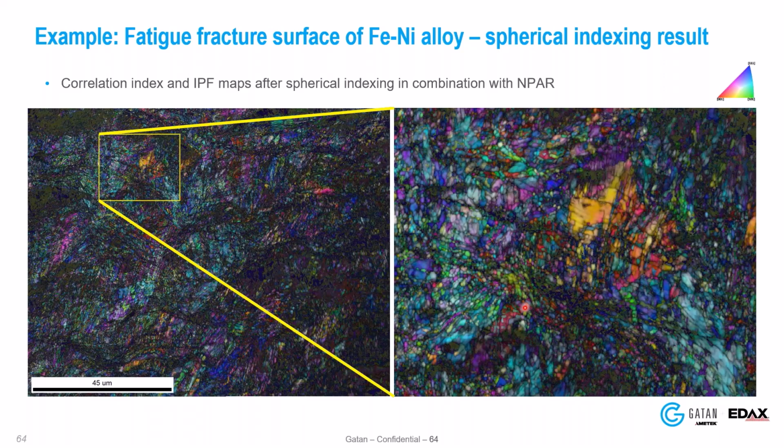On a fracture surface, this is a new type of analysis that's really enabled by spherical indexing and NPar on these types of fracture surfaces that traditionally you couldn't index well, and you didn't really want to polish these flat, because you lose some of your fracture surface information.